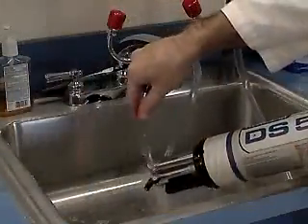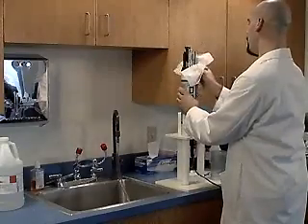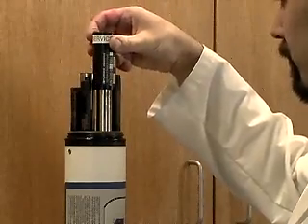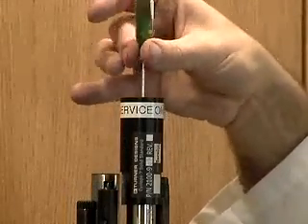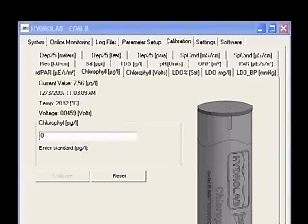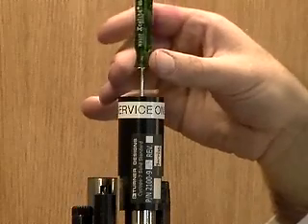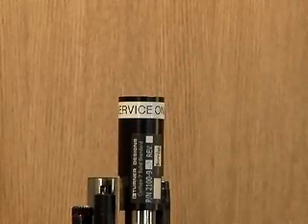Have an extraction performed on the sample to find the true concentration. If you are using the solid standard, rinse and dry the sensors and place the standard over the top of the fluorometer. Use the small screwdriver provided to adjust the standard until the micrograms per liter reading displayed in the Hydrus window is the same as what was recorded for the sample. When the current value matches the recorded value, tighten the top of the solid standard to lock it to that value.